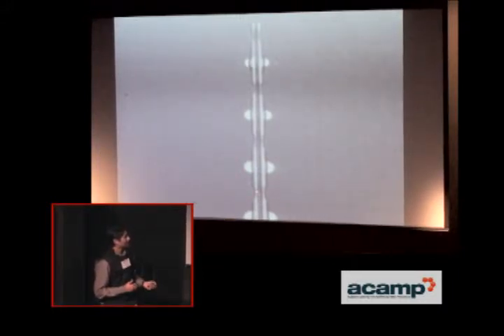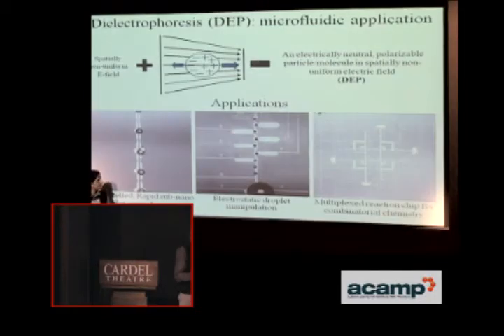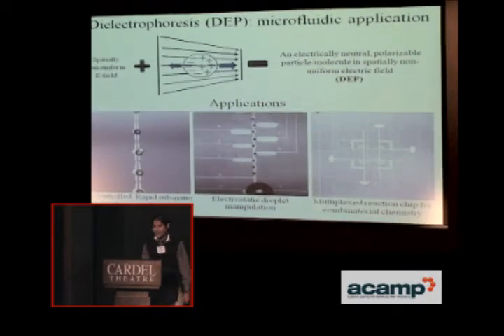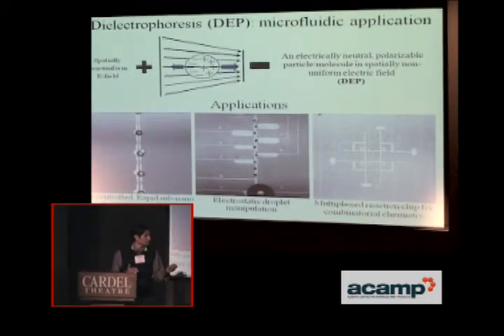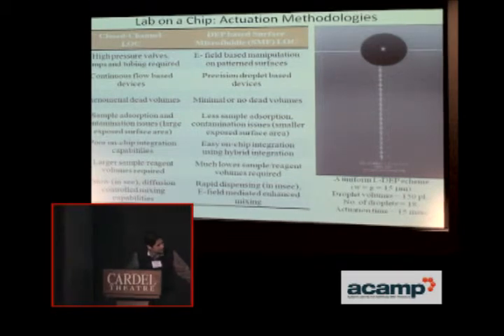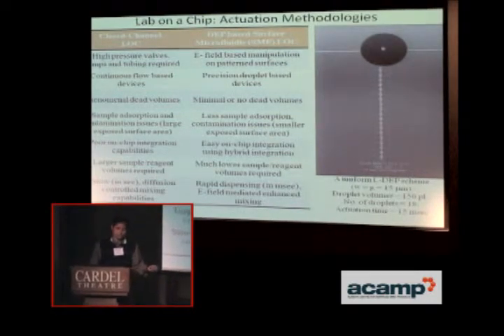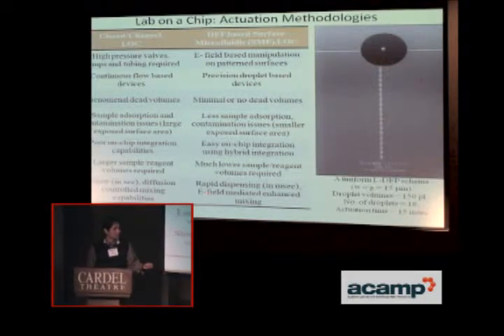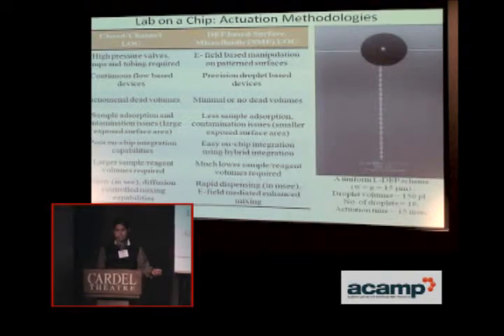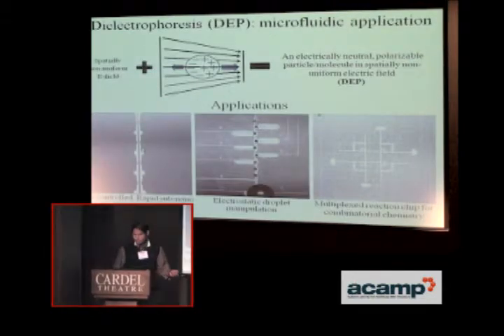The scheme is we form a liquid jet and we control the breakup of this liquid jet to form arrays of droplets. The actuation process is a high-speed actuation process, and as you can see from some of the details here, the droplet volumes can go very low, a few picoliters, and the actuation rates are very high. It only takes a few milliseconds to dispense arrays of droplets with very good flexible control.